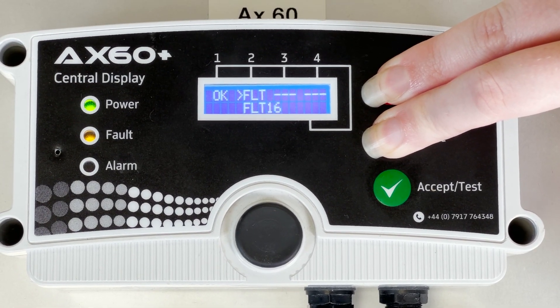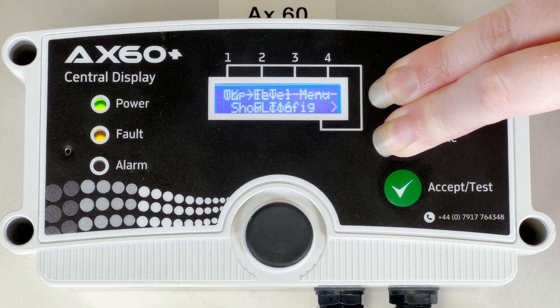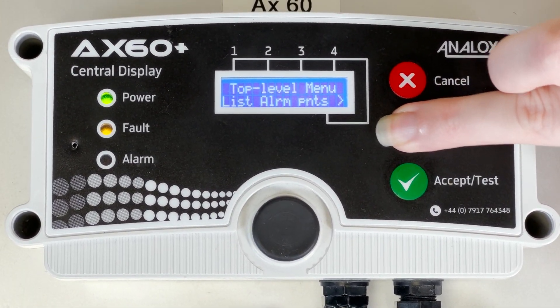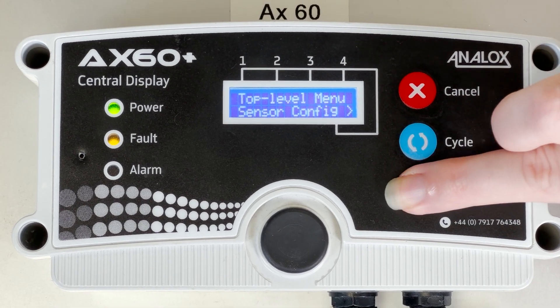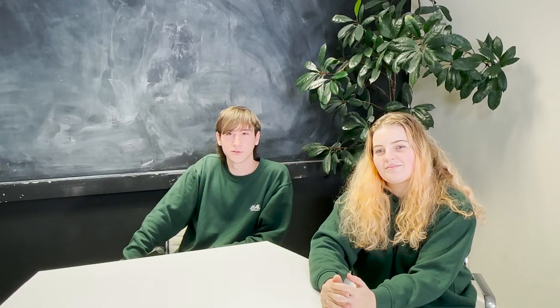To access the top level menu you must hold down the cycle and cancel buttons at the same time. Pressing the cycle button a further six times will take you to the sensor config, which you must press accept to enter. Press the cycle button two more times so that it shows alarm direction and press accept to access this menu.